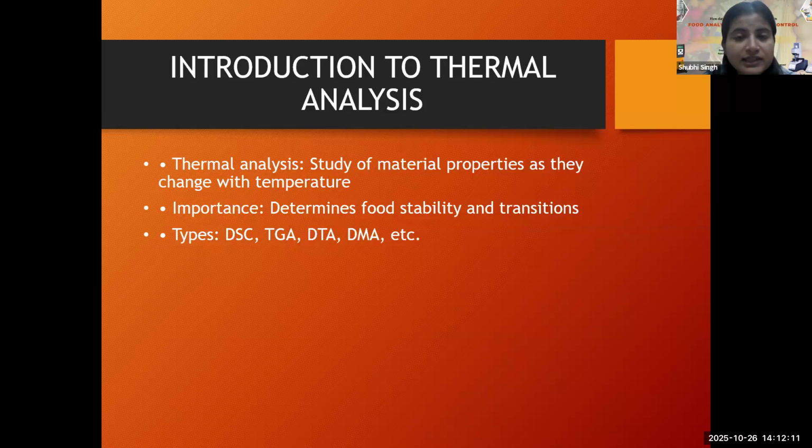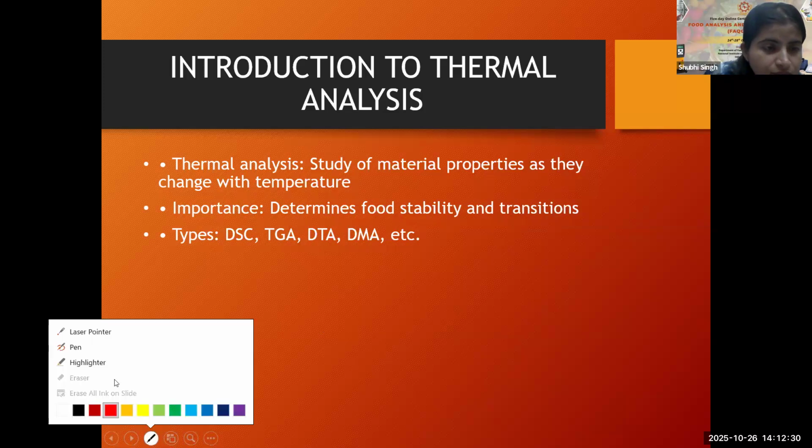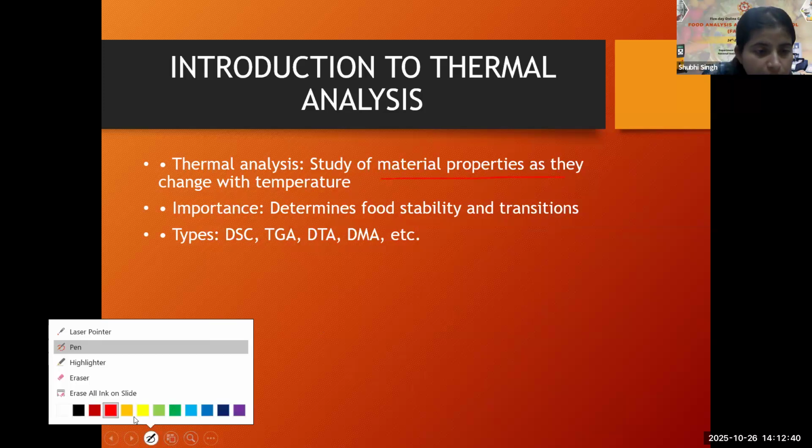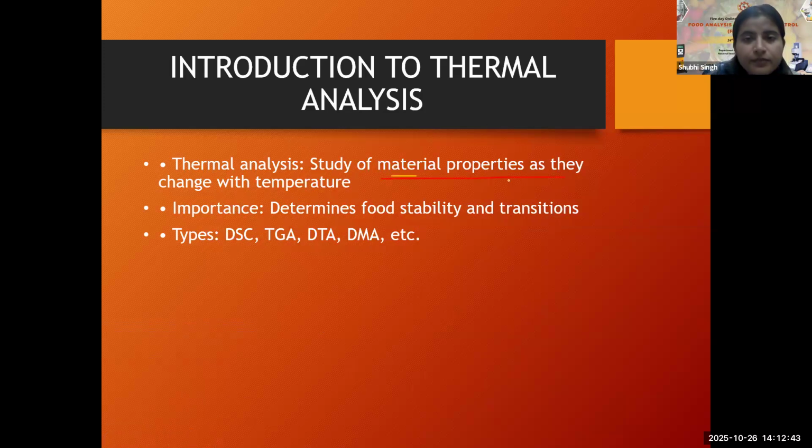It is solely dependent on temperature. As the name suggests, it is solely dependent on the temperature. Okay. So, thermal analysis is the study of material properties as they change with temperature.